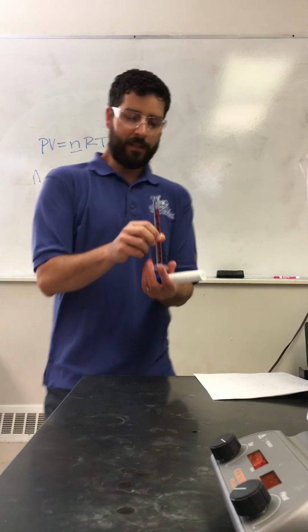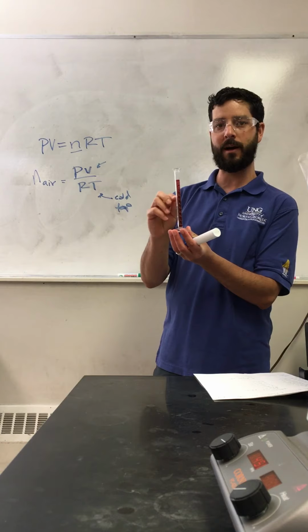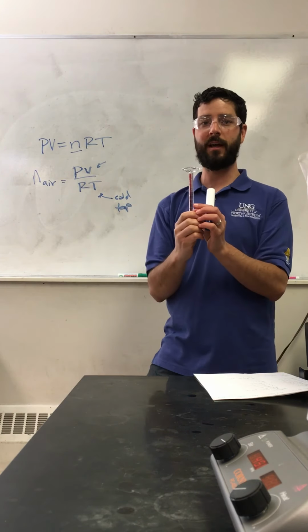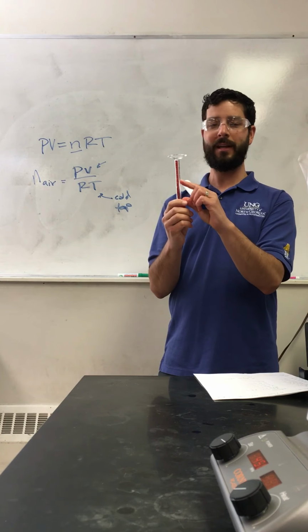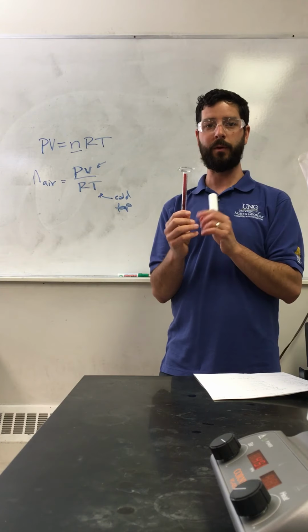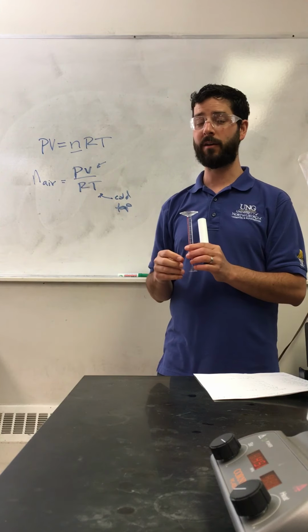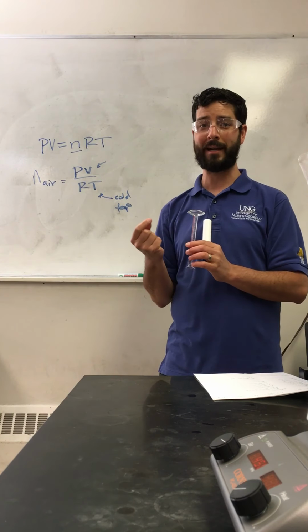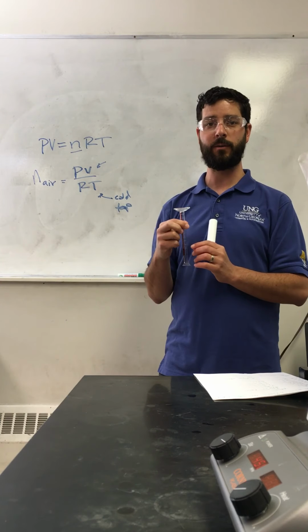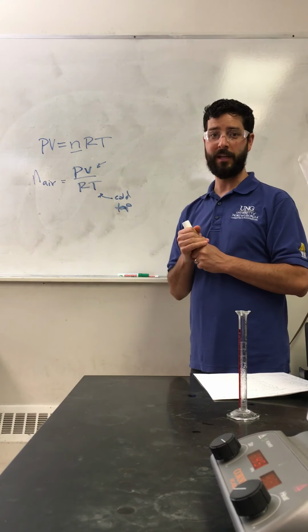we normally use a graduated cylinder upright, and so the graduated lines that measure the volume are set up for a meniscus that's upright. But when we invert this upside down, the volume that we're reading is actually wrong because the meniscus is inverted, and we're looking at a bubble instead of a meniscus of a liquid, like normal. So you're also going to make a slight correction to these data points by subtracting a certain value from them to account for the flipping of the graduated cylinder. So you're going to have, in the end, a pressure and a temperature for each of these.